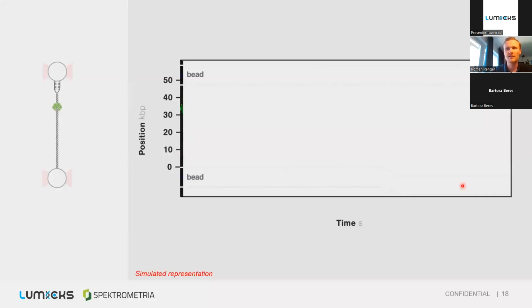To see this whole experiment in action, we've prepared this small example experiment here. Again, what I've shown before was these two optically trapped beads connected with a DNA molecule. It's a little bit under tension, and it's already a little bit opened here. So here you have a so-called melting bubble, and you already have a fluorescently labeled protein here. And what we will now do is we will expose this protein to different environmental conditions using the fluorescence imaging system and also the microfluidic system. And we will monitor, basically we will scan along this DNA molecule and see what happens there.